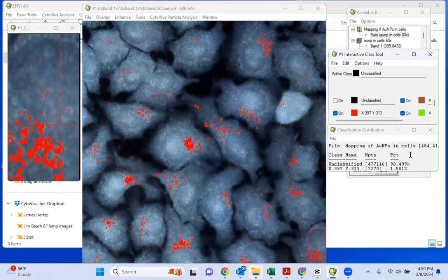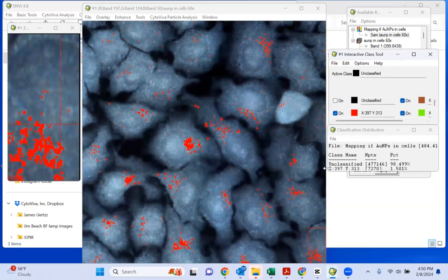And then here we can even get a class distribution showing how many pixels in the image are unclassified and how many pixels are classified as gold particles.